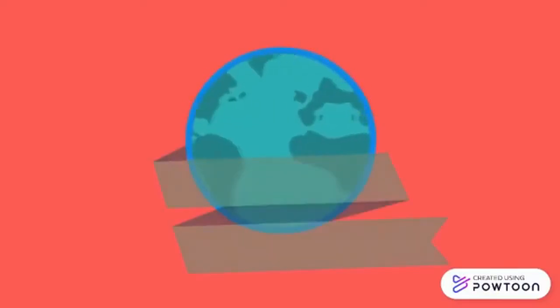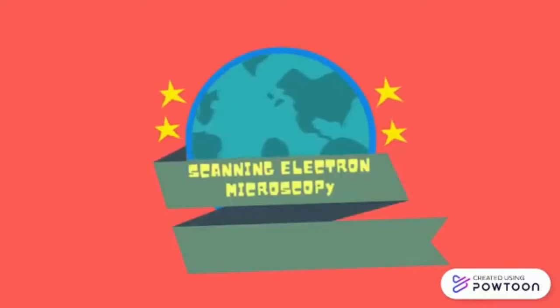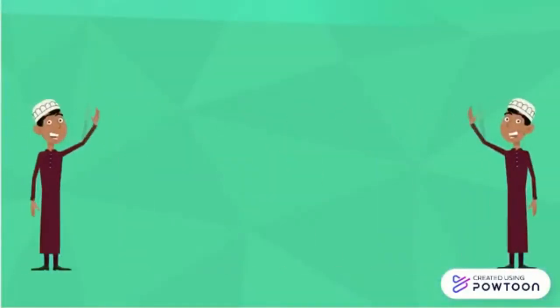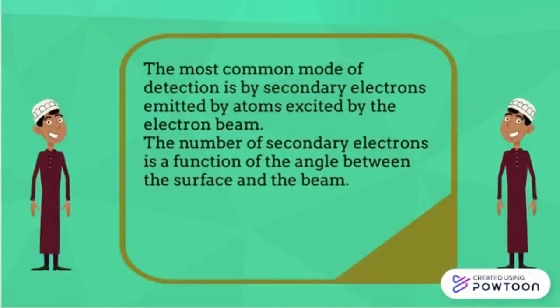I'm going to explain about scanning electron microscopy. Scanning electron microscopy produces an image of a sample surface by scanning the surface with a focused beam of electrons. The most common mode of detection is by secondary electrons emitted by atoms excited by the electron beam. The number of secondary electrons is a function of the angle between the surface and the beam.